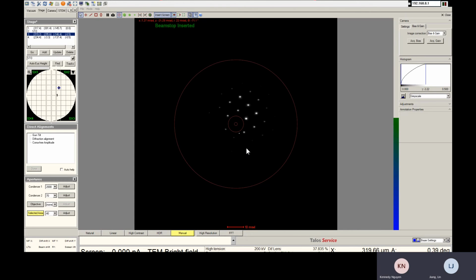Okay. Well, at least the spots are smaller, so there's less noise.